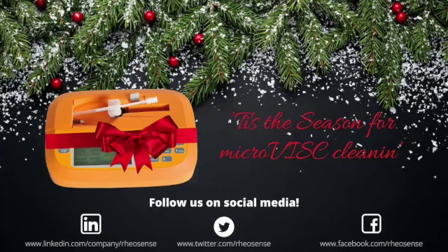So some questions rolling in. The chip cleaning station software is built on board. You have a touch screen, and everything you need to do is accessible here. If you want to add solvents, you can add them. If you want to create more protocols, you can add them here as well. And also, if you want us to make a protocol and send it to you, you can import it via USB stick.